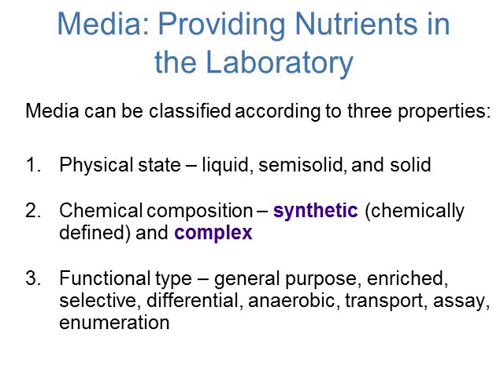We can have enriched agar, where we add something to it, selective agar, differential, anaerobic agar or media, where we grow it in areas with no oxygen. Transport media, if you're taking a sample and sending it to a lab. Assay media, enumeration media. So we have lots of different media that can be used for lots of different functions, depending on what you need to do.